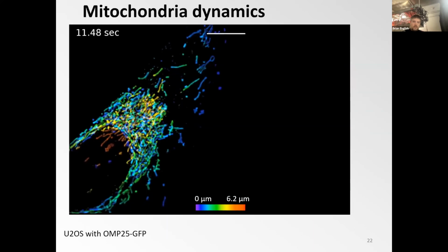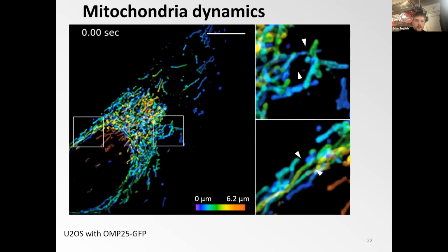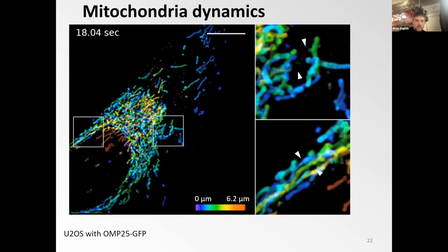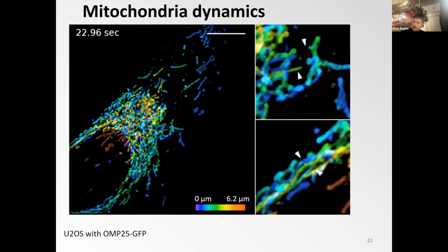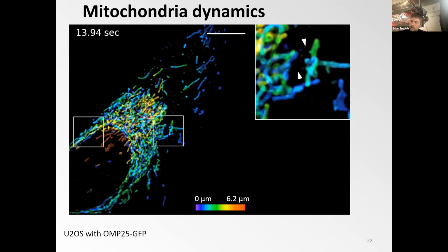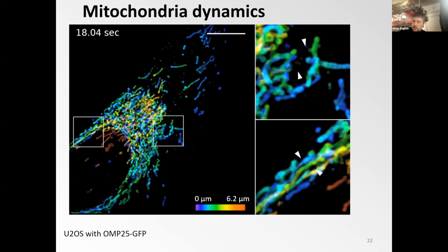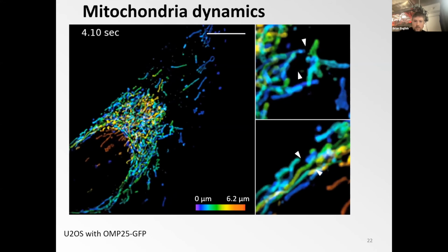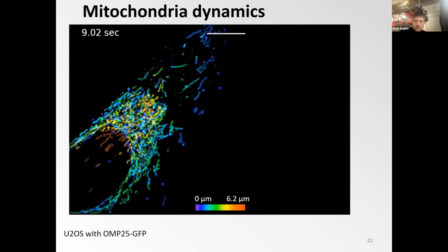The other advantage compared to the SoRa is that you can now do very rapid imaging. So this is structured illumination, volumetric imaging at 1 Hertz volume rate, which would be hard just from the laser powers, say, with the SoRa, and it would be hard with a Gustafsson-type 3D SIM, because you have to acquire a lot of data, and you have to mechanically step the focal plane.